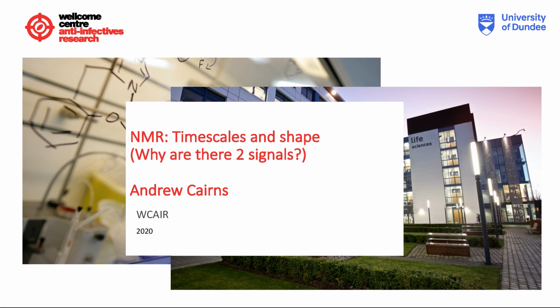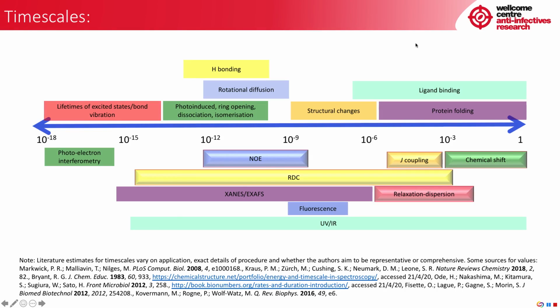Welcome to an NMR tutorial on the effects of dynamics on the NMR timescale and the conformation of analyte molecules. For all the amazing information NMR gives us, it is both insensitive and slow. The sensitivity we've previously addressed, it results from the small population difference we observe in our spin states due to the magnetic field. But what do I mean when I say slow?